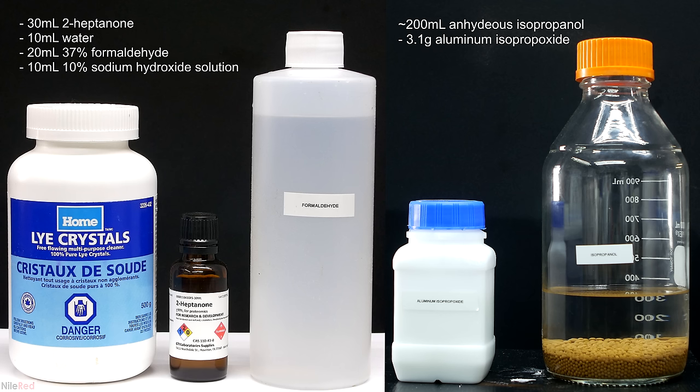For the MPV reduction, I made the aluminum isopropoxide in a previous video. The anhydrous isopropyl alcohol was prepared by adding some molecular sieves to some 99% isopropyl alcohol that I purchased from a local company.